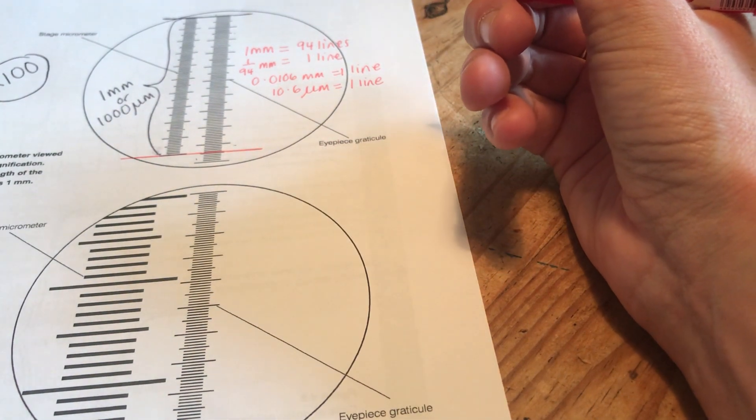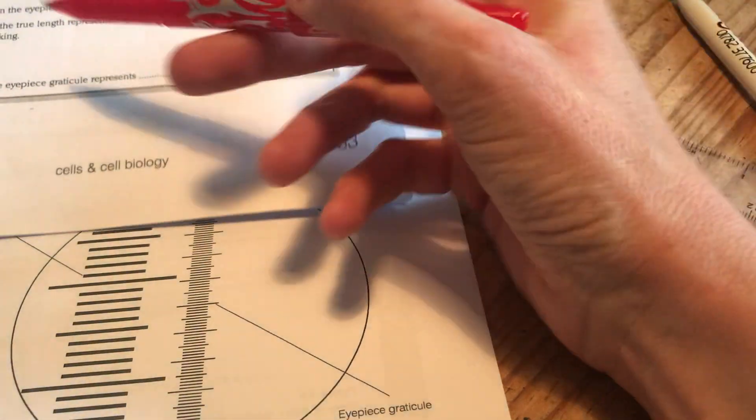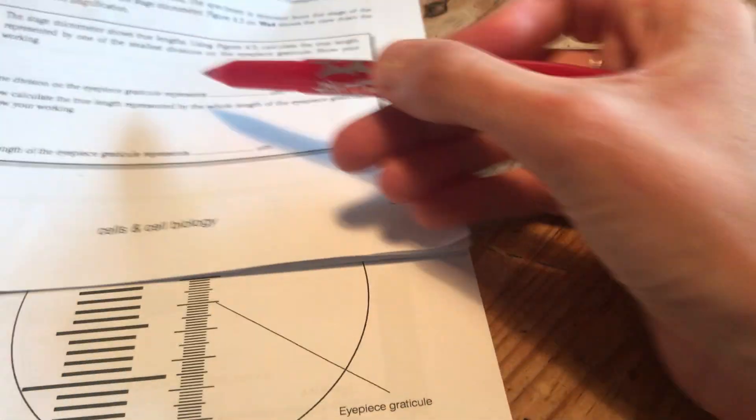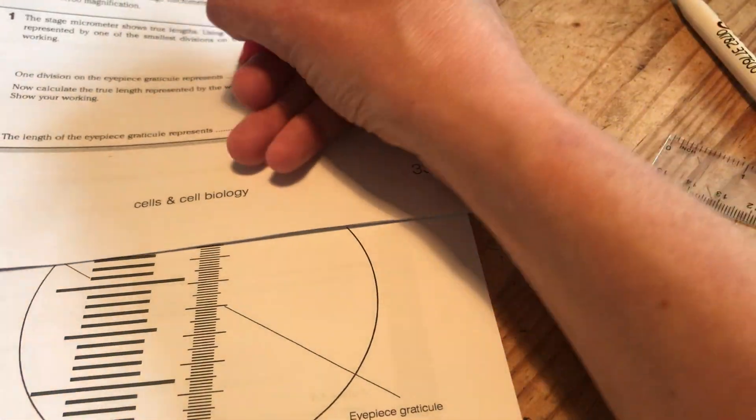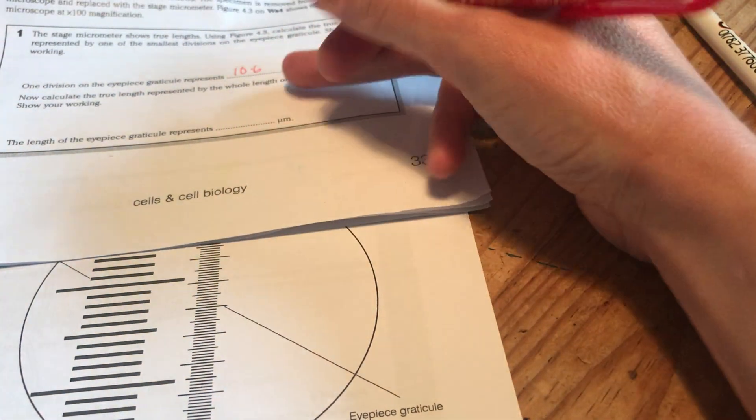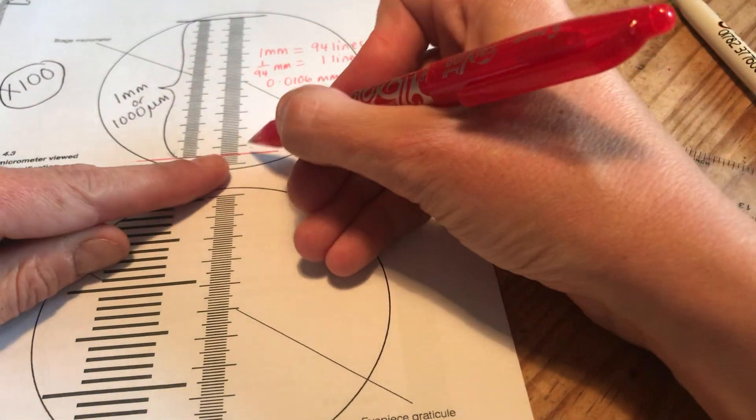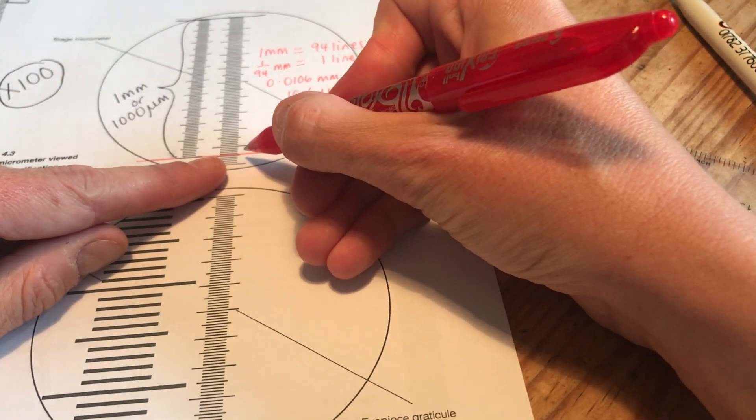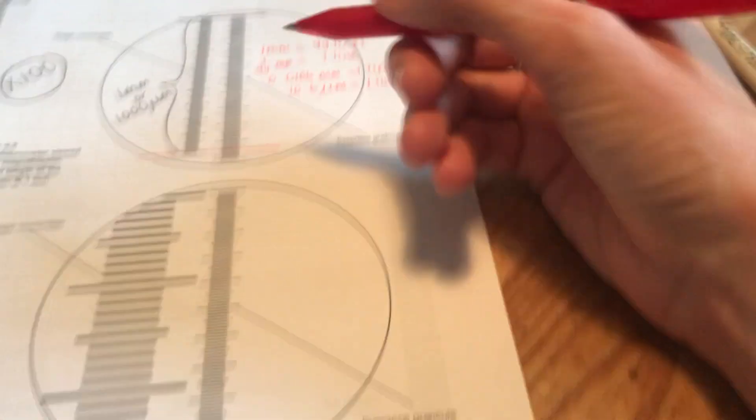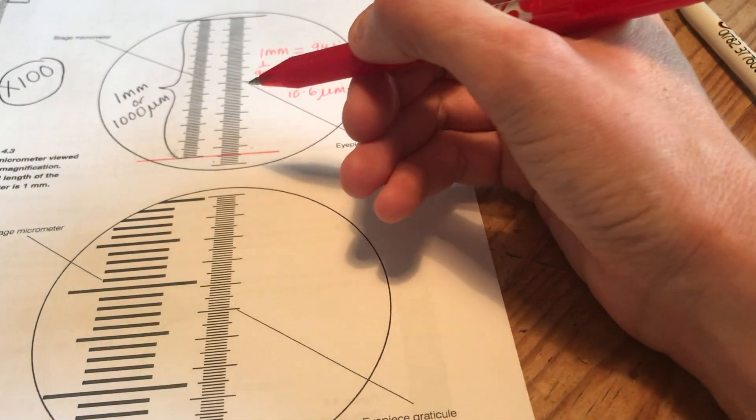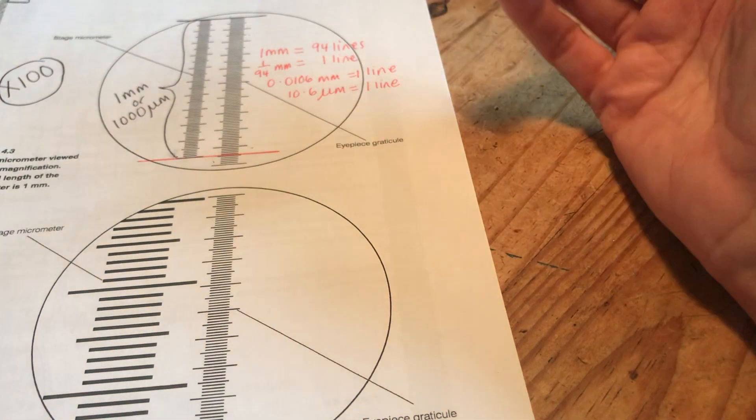So that was my first question. It said how much does one division on the eyepiece graticule represent? It represents 10.6 micrometers. You might get a little bit of a different answer to that depending on which of those lines you've chosen. I've gone for 94. You might go for 95. You might be more precise and say it's worth 94 and a half lines. The closer you get the more accurate you'll be.